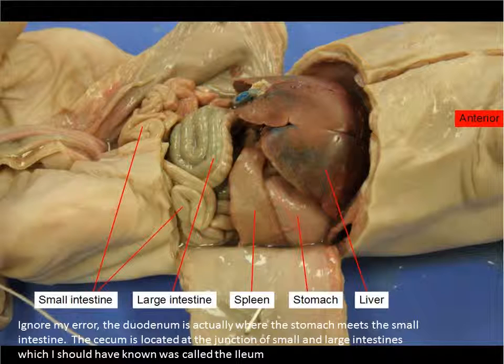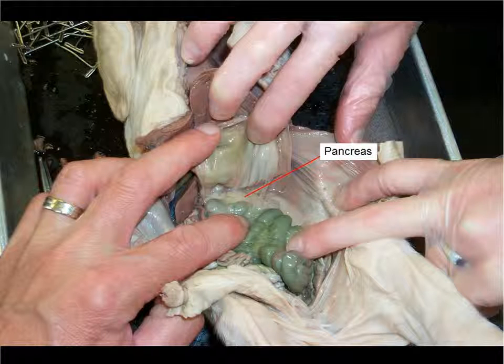Now, why am I talking about that here? Because your pancreas, despite the fixation, may just be a bunch of goo. Okay? So we'll look for the best sample and point that out to you. I think this pig in particular was fairly fresh, but in an ideal world you would see the pancreas as kind of this fatty looking substance. Again, maybe a couple of curdles or grains, all very webby stuff.